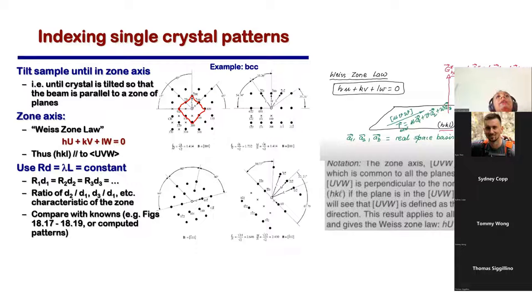And this is where the entire basis of microscopy lies. So this is a kind of pattern, and you should be very clear that in BCC, which would be your iron, some iron alloys and basically pure BCC metals, they will present a zone axis like this, and which will be a 001. And now for the 011 zone axis, how does it look?